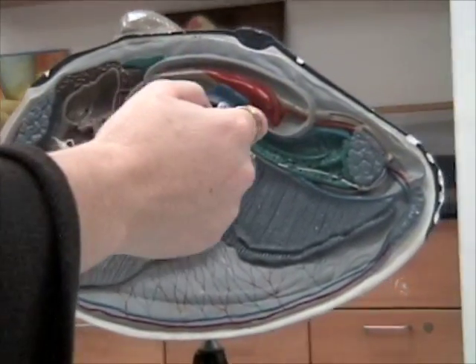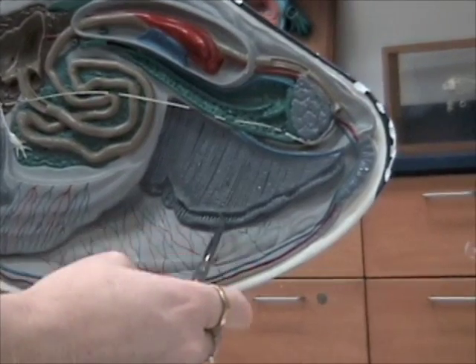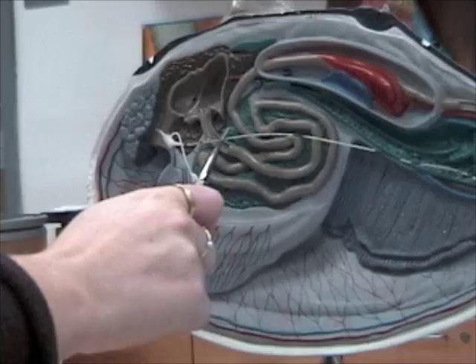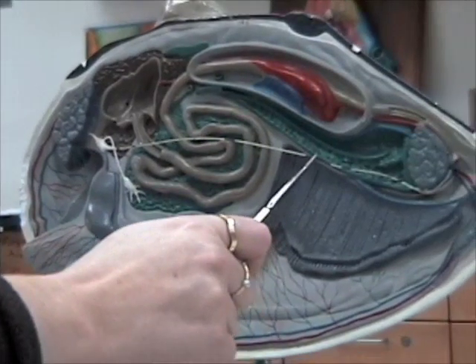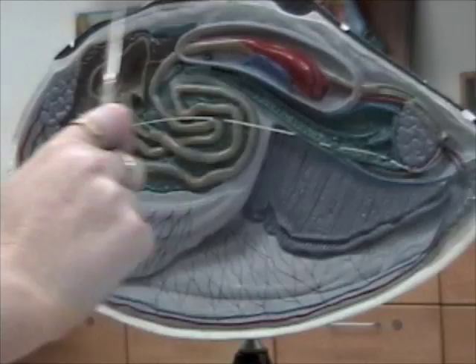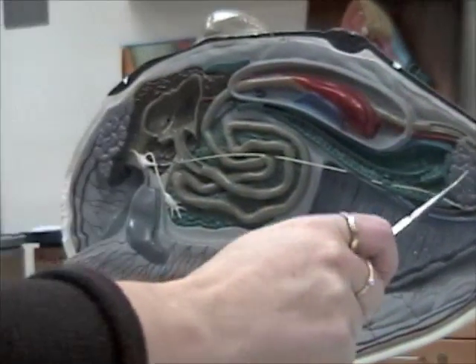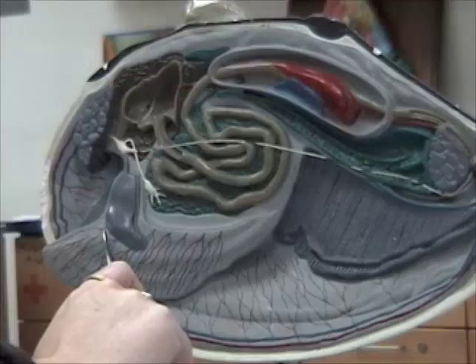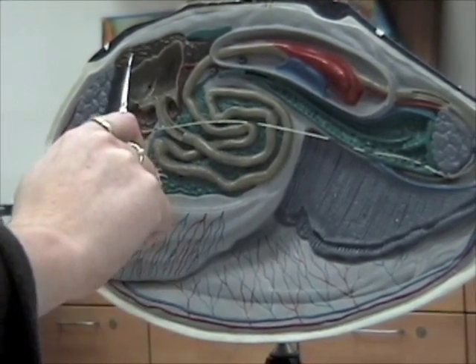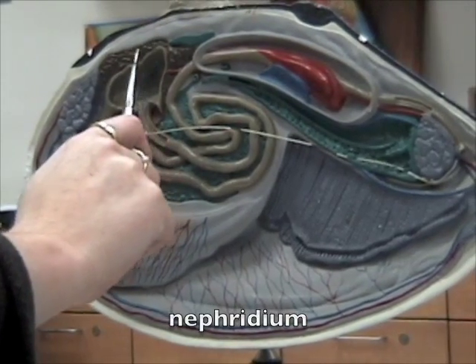Stomach and intestinal system. There are the gills. This is the nervous system. Adductor muscles. Foot. This ought to be the nephridium.